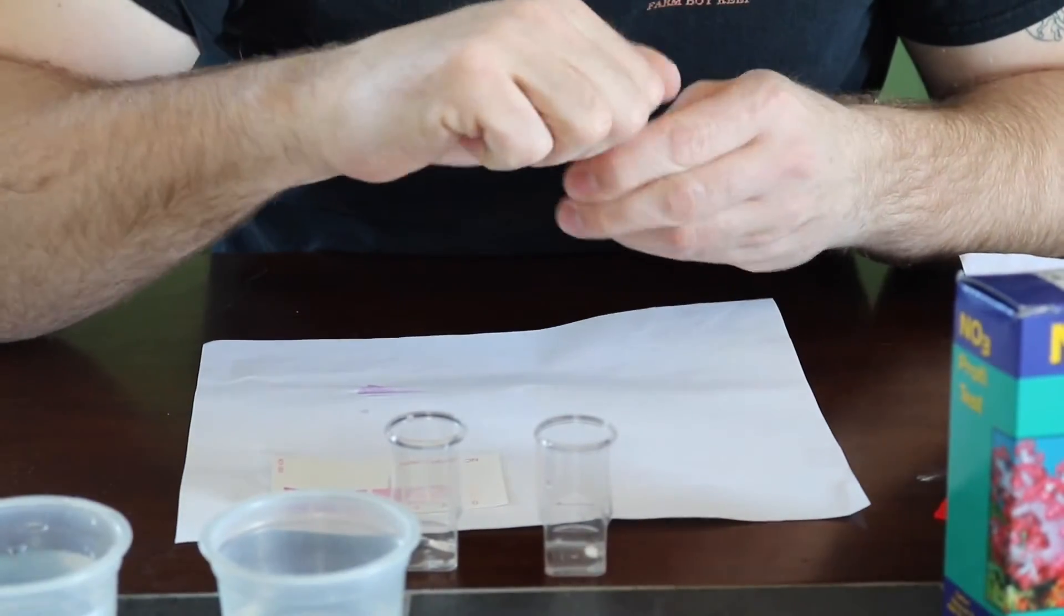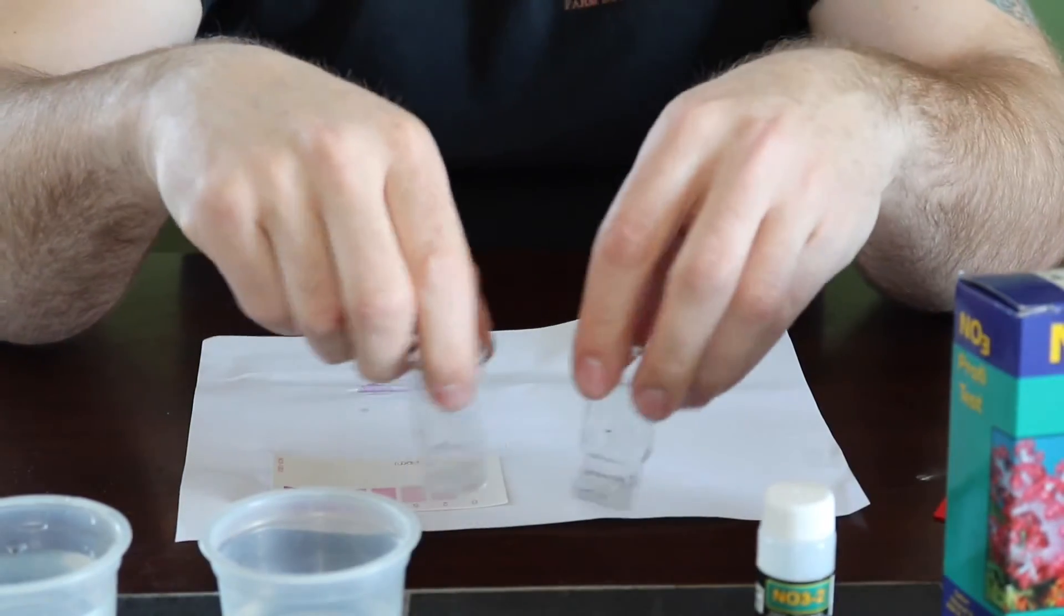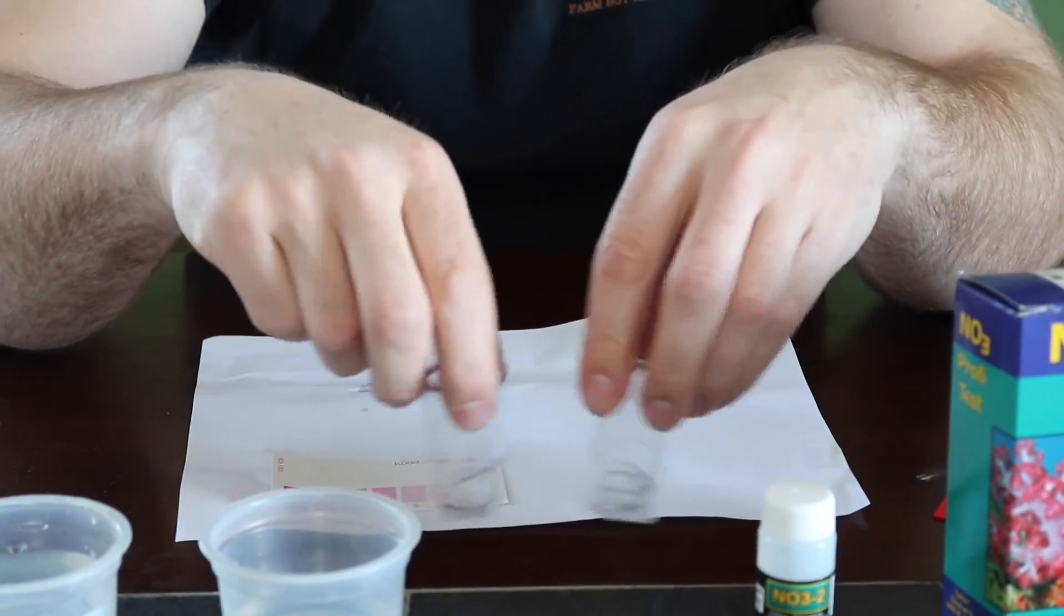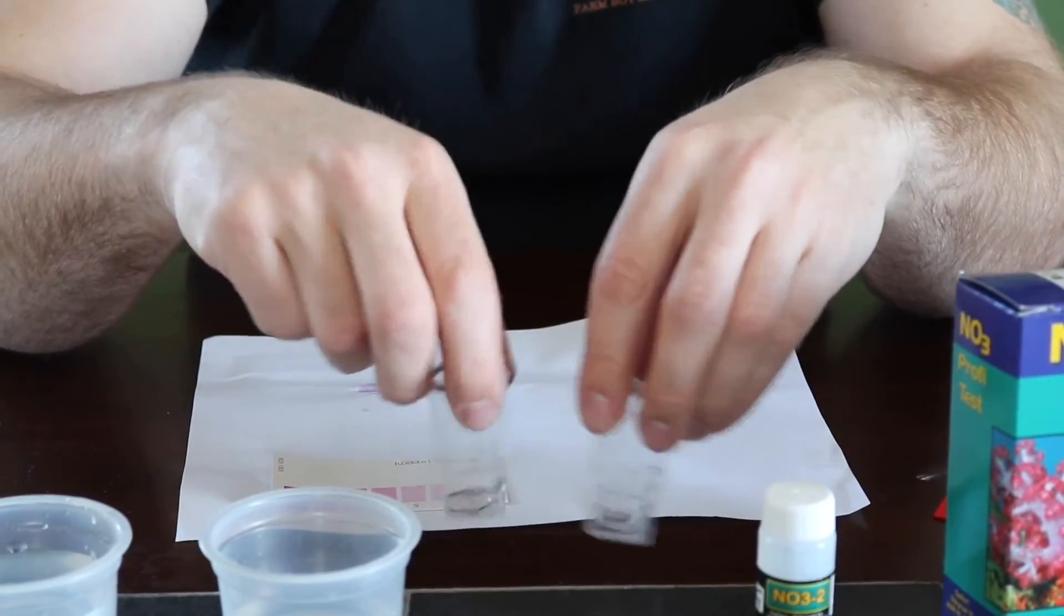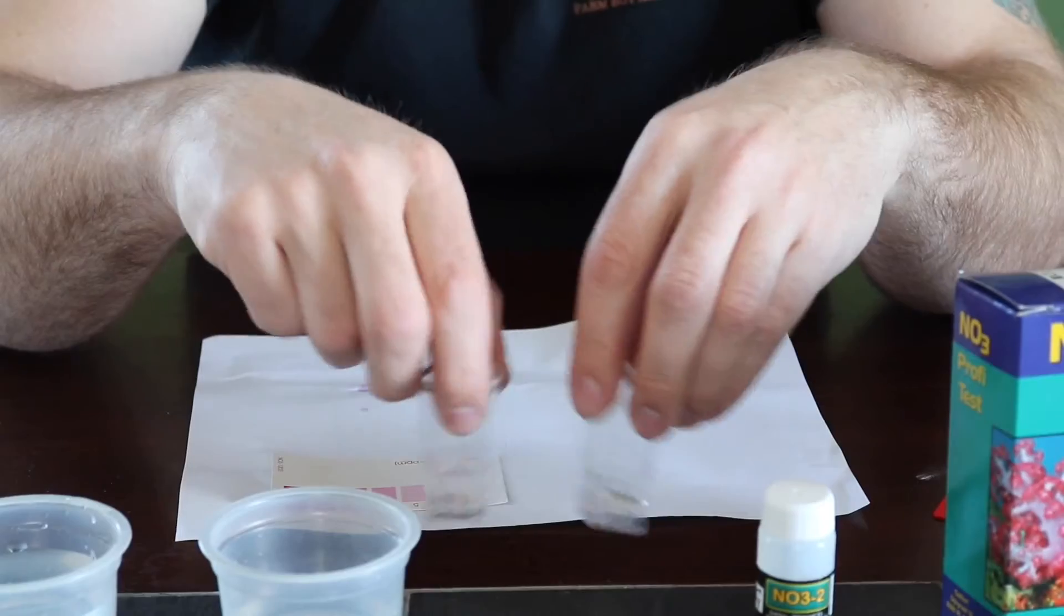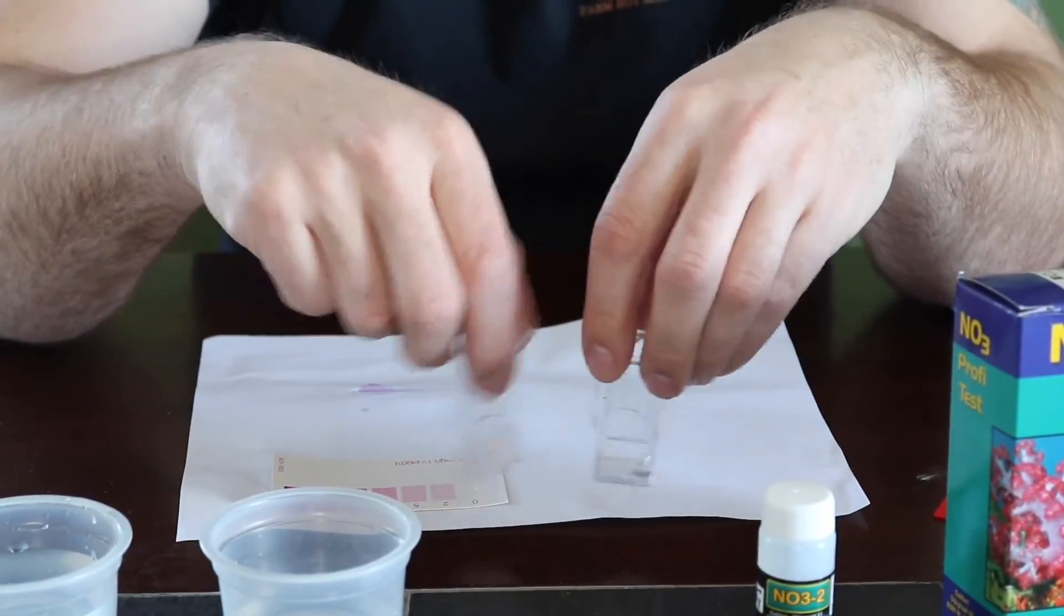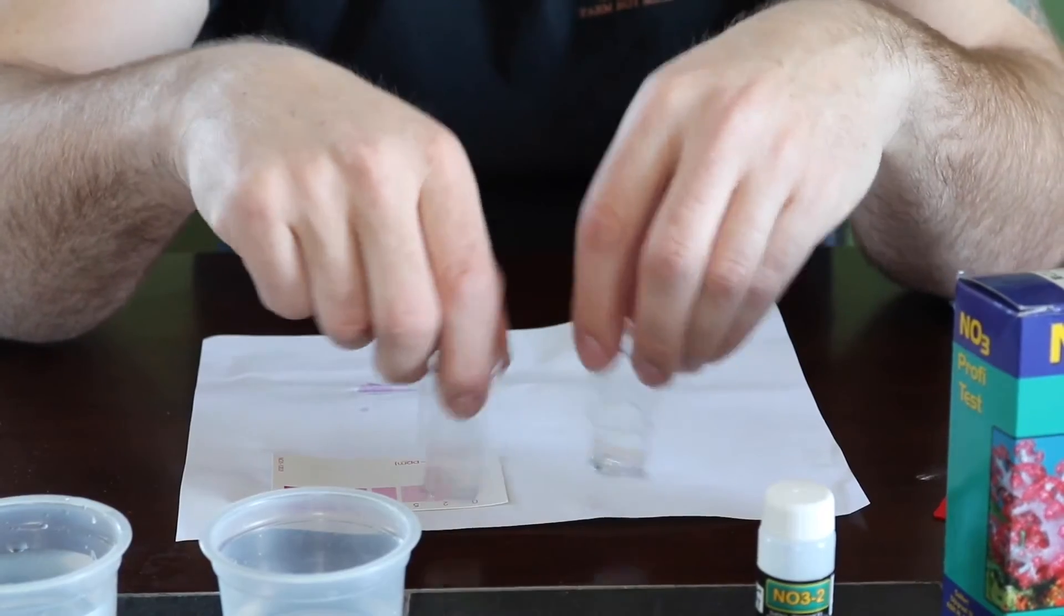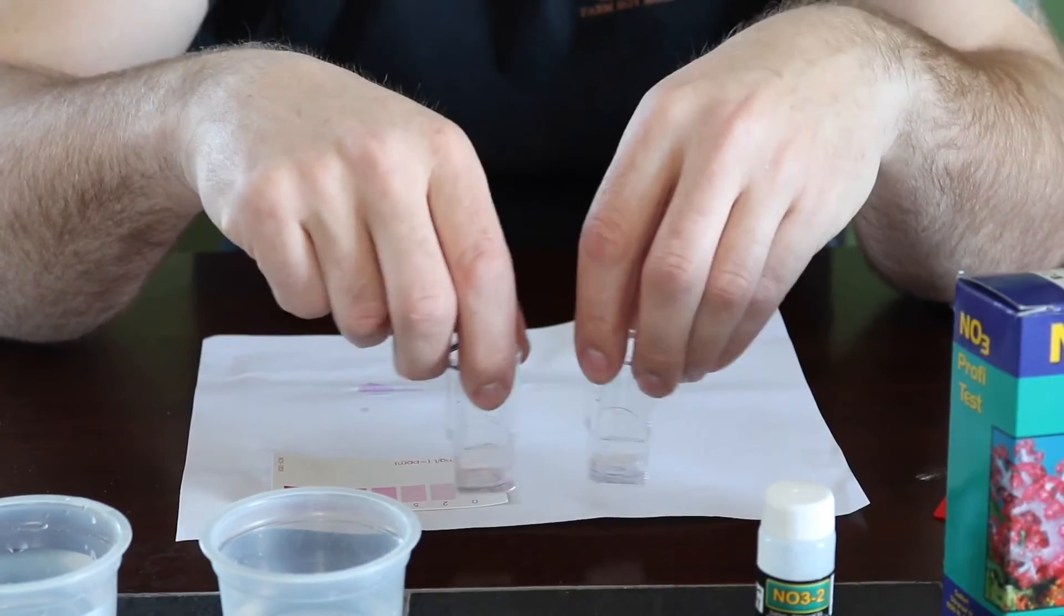And then what we're going to do is we're going to shake these for 30 seconds. So one, two, three, four, five, six, seven, eight, nine, ten, eleven, twelve, thirteen, fourteen, fifteen, sixteen, seventeen, eighteen, nineteen, twenty, twenty-one, twenty-two, twenty-three, twenty-four, twenty-five, twenty-six, twenty-seven, twenty-eight, twenty-nine, thirty.